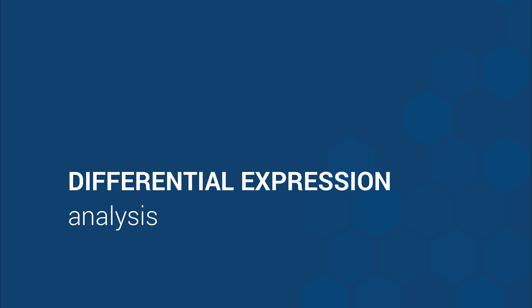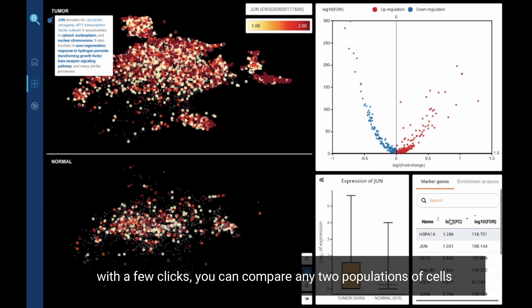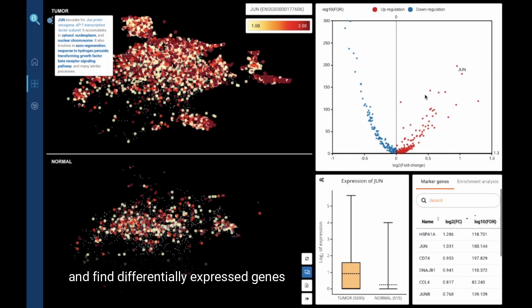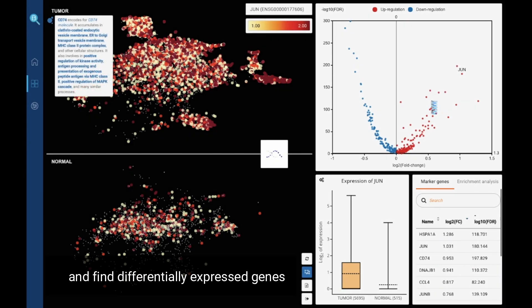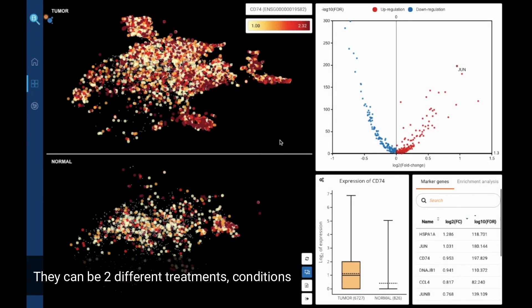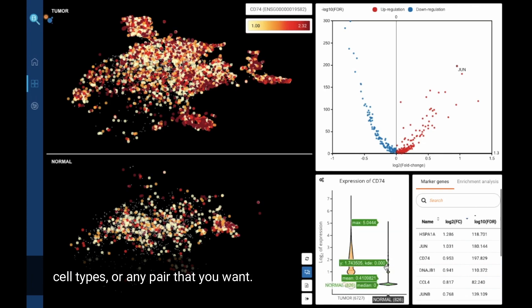Find differentially expressed genes. With a few clicks, you can compare any two populations of cells and find differentially expressed genes. They can be two different treatments, conditions, cell types, or any pair that you want.